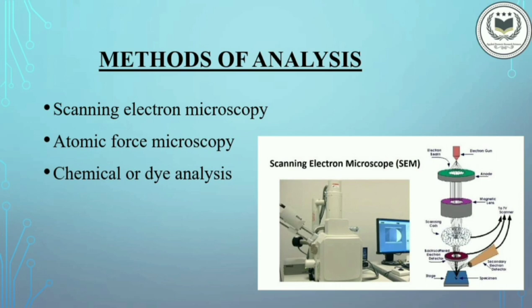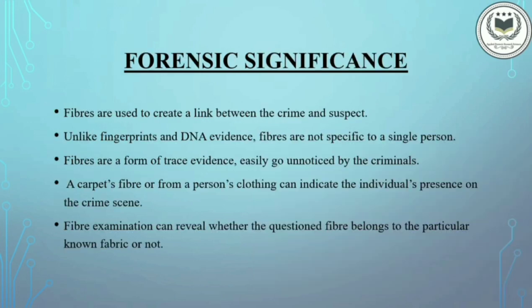Then we have dye analysis. Dye analysis involves extraction of dye from a fiber sample and thus characterizing and identifying its chemical structure. This method of dye analysis is a destructive method which leaves the fiber useless for further color examination.